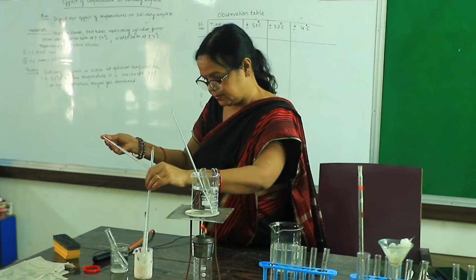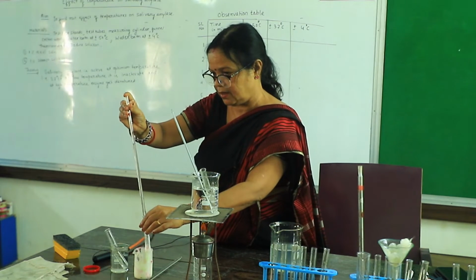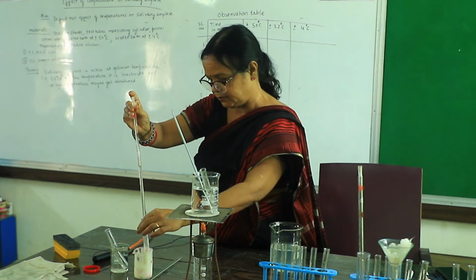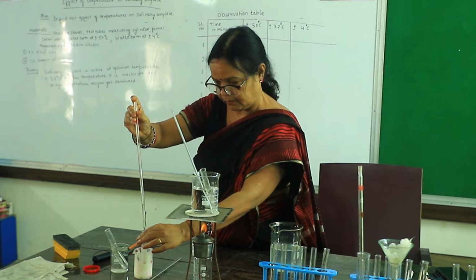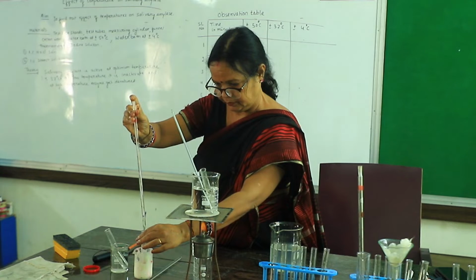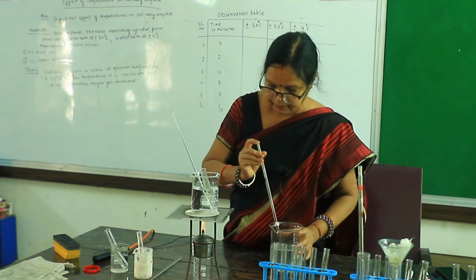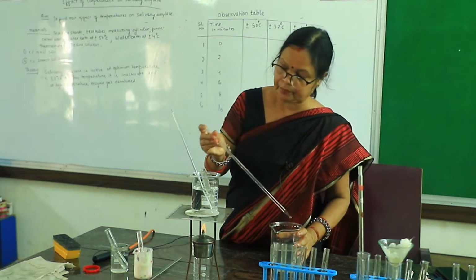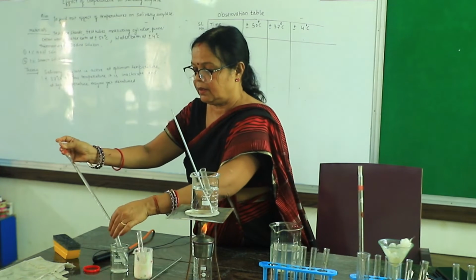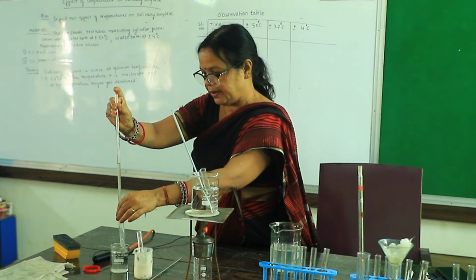Then the test tube containing salivary amylase and 5 milliliters of starch goes in an ice bath. Next, the test tube that remains at normal temperature, that is 37 degrees centigrade.